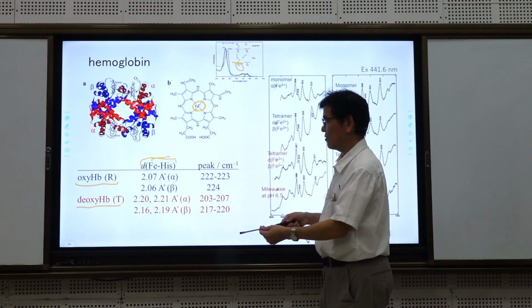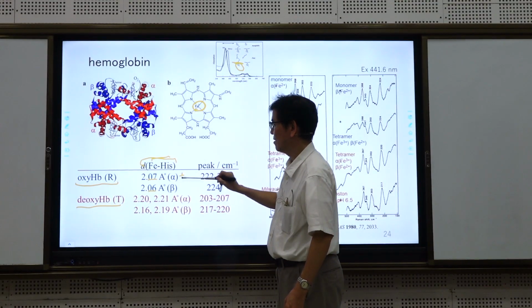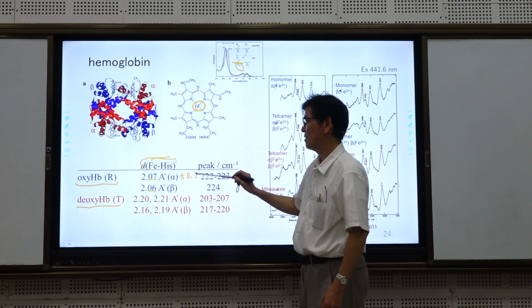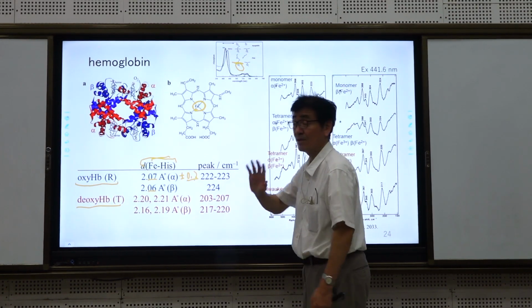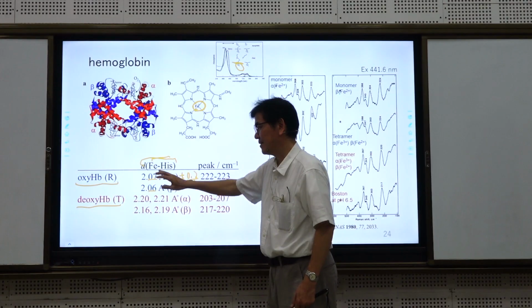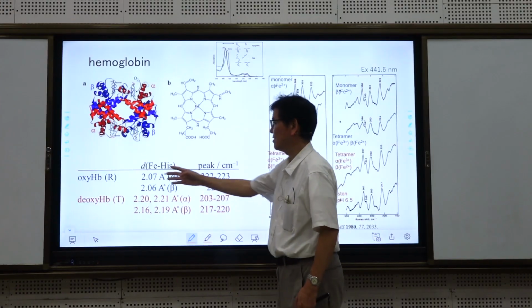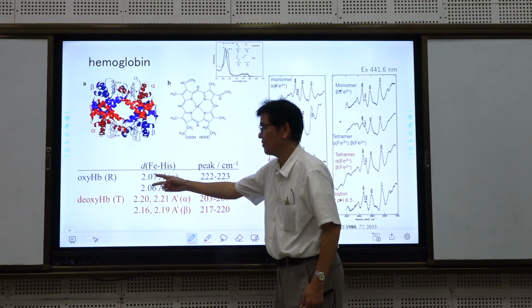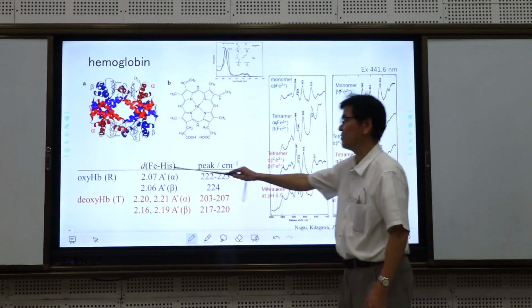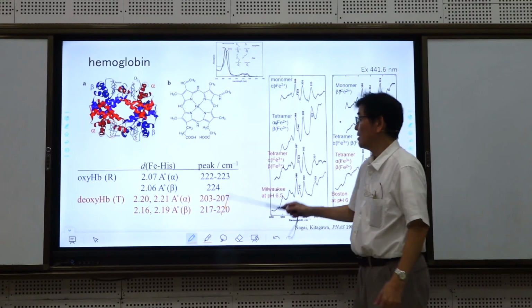So even though they insist 0.7 or 0.6, this number is not exact, but at least the error is large enough that the difference is within the measurement error. Average value is different, but error is still large, so they cannot distinguish the two states.